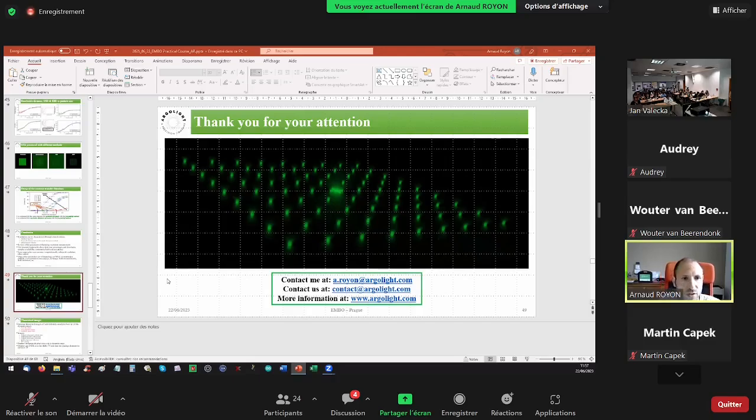If you want to measure the influence of the immersion refractive index on the resolution, then you can change the immersion medium, and of course we get a degradation of the performance in terms of spherical aberration and signal-to-noise ratio and so on.